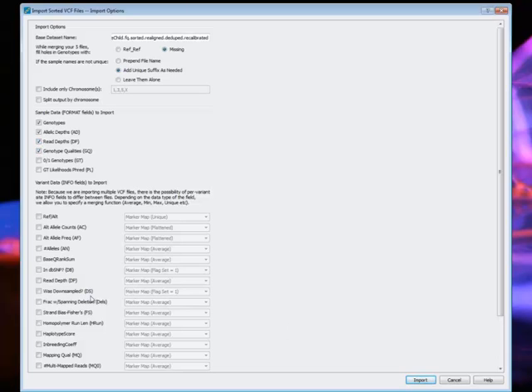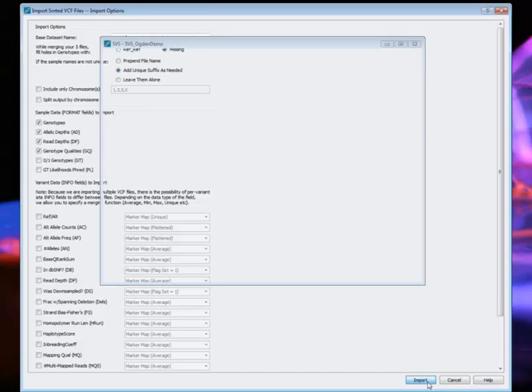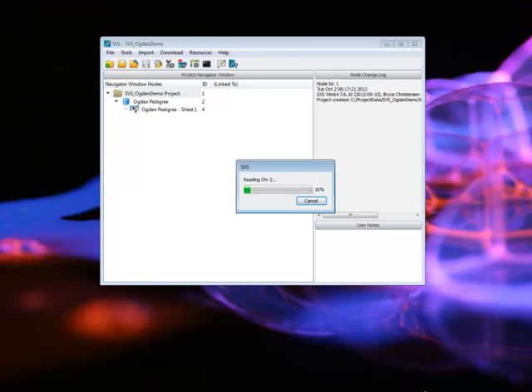With SVS, you just need to select which items you want to have available for analysis. If you need to go back and get others later, it's not too difficult to do. It's going to scan through those 5 VCFs and create a few spreadsheets of data that we can work with as we go along. This will just take a moment.